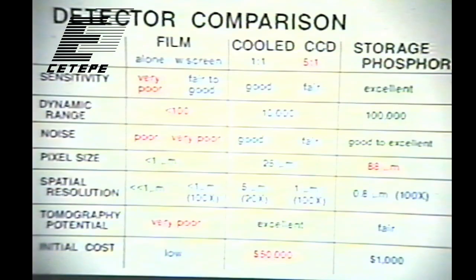And so to calculate the dynamic range of a CCD, you need to know this other parameter called the full well capacity. That's the maximum number of electrons that can be stored in 1 pixel. And a typical number is about 250,000 to 1 million. So you can calculate the maximum achievable dynamic range by taking this saturation charge and dividing by the noise, and that's the dynamic range. Whereas for a consumer device, you'd see the dynamic range would be compromised because of this high noise.